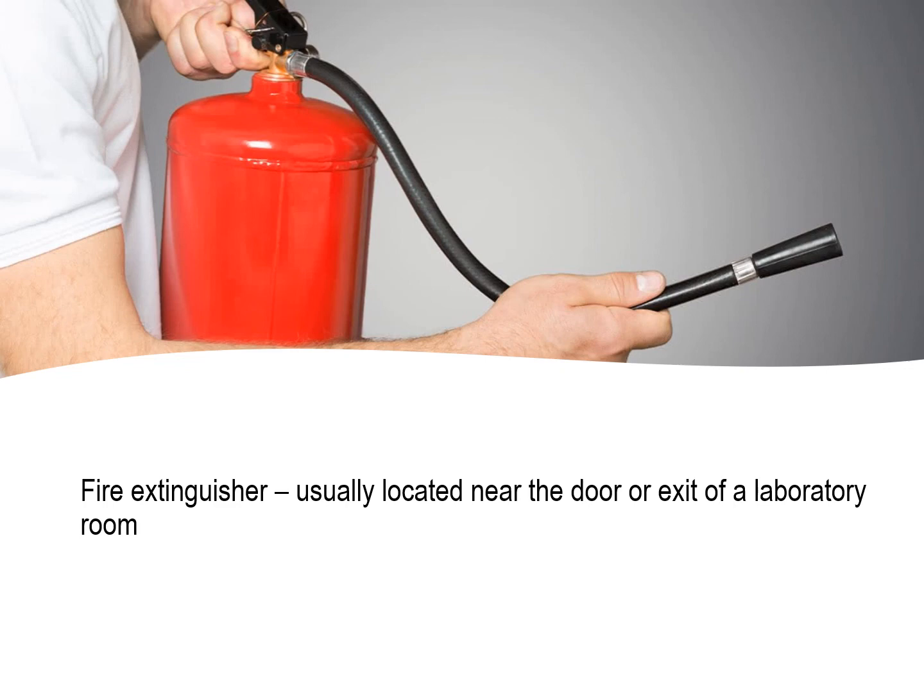We also have our fire extinguisher. This is also one of our laboratory safety equipment. This helps us put off or extinguish fires inside the laboratory. So please do not forget the acronym that we discuss or use when operating a fire extinguisher. We have the PASS. And also, please do not forget the different classes of fire, the types of fire, and the fire extinguisher that is required to put off a certain type of fire. So please do not forget that, that's very important.